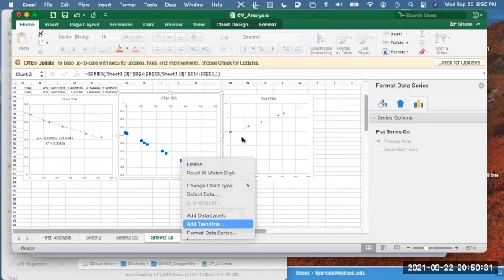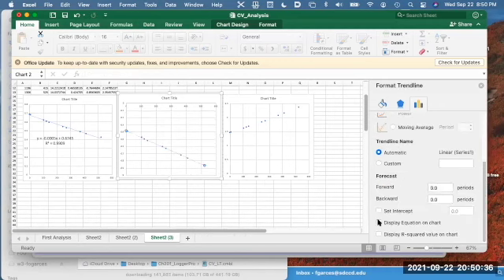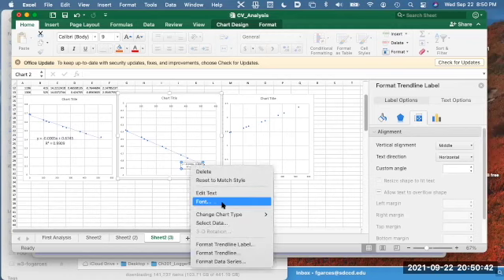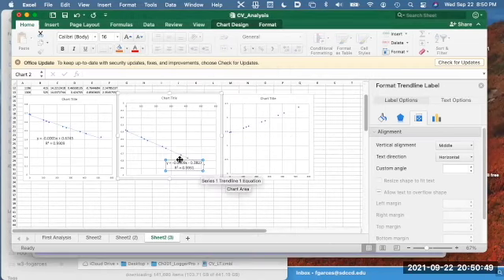So what I want to show here is that when I do the trend line and I generate the equation and compare the correlation factor in which I just have about 10 data set versus one in which I've probably had about 80 to 100 data set, the correlation factors are pretty much very close to each other.